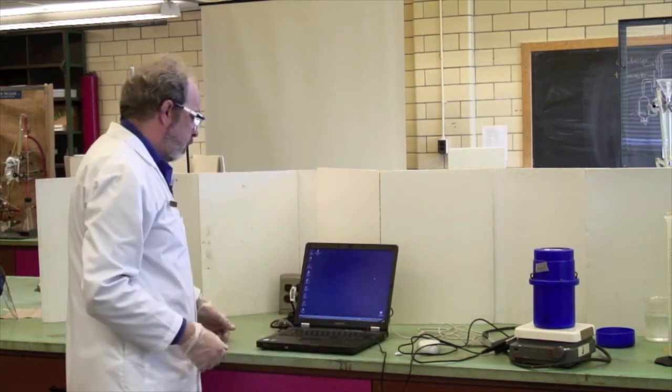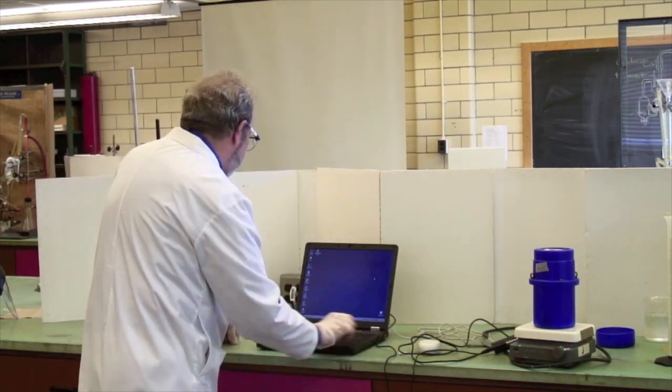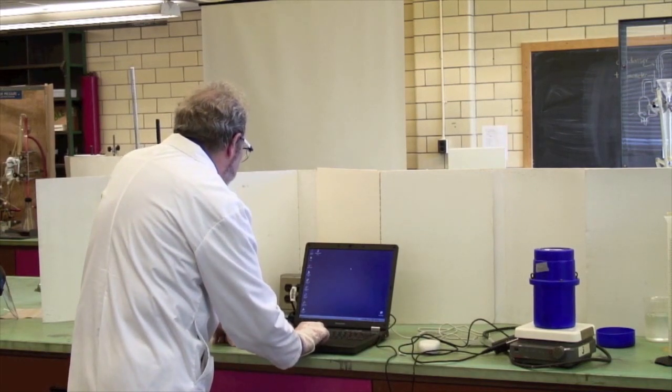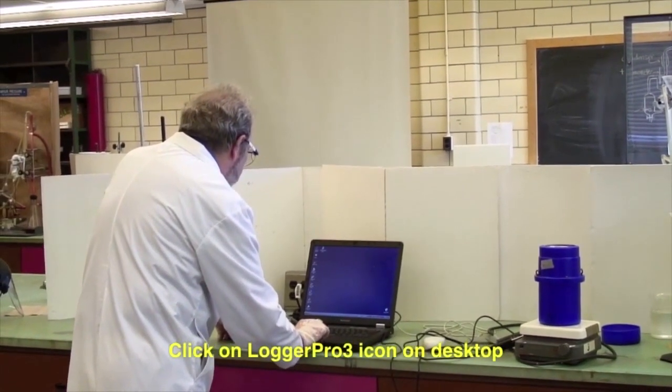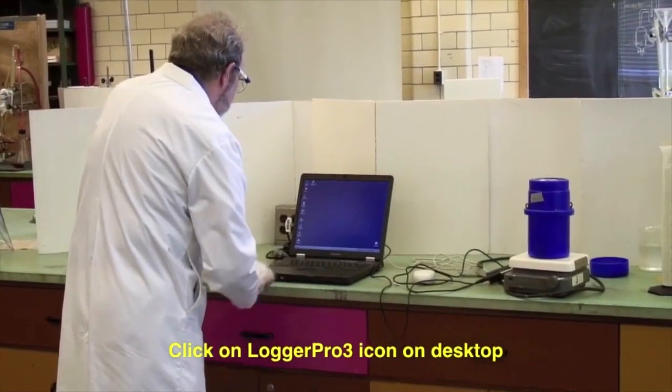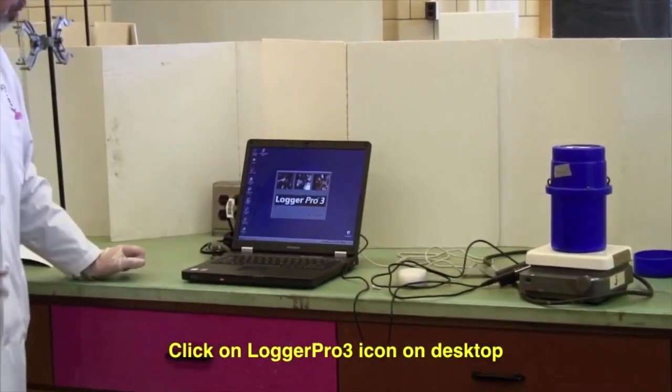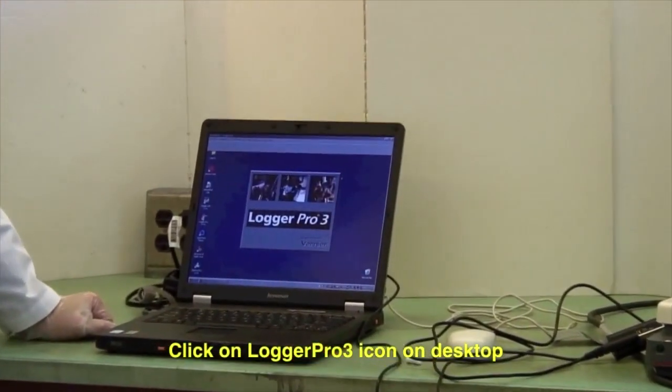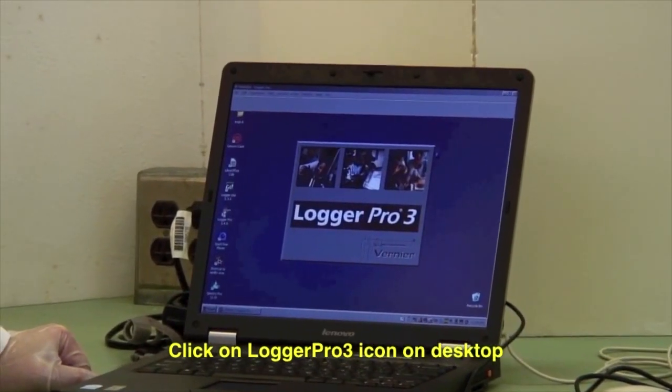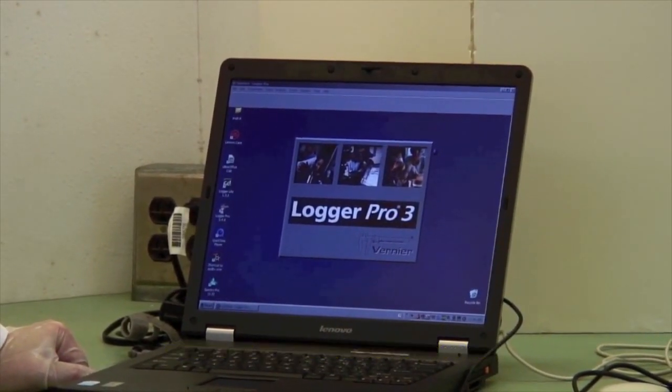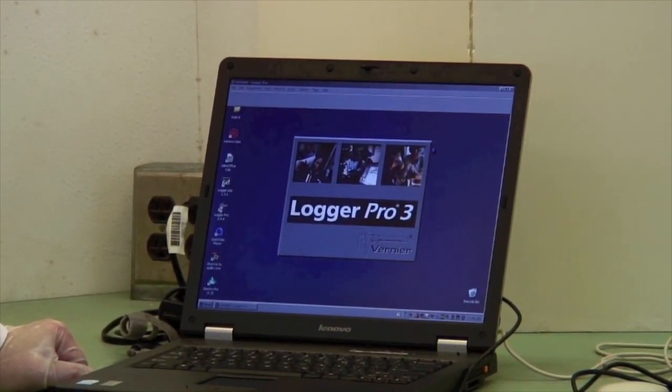It's now recognized. You are looking for Logger Pro 3.6, so double click on that. It will fire up and the software is smart enough to realize that you have plugged in a thermocouple as opposed to say a pH probe and it will pull up a temperature as a function of time graph ready to go.